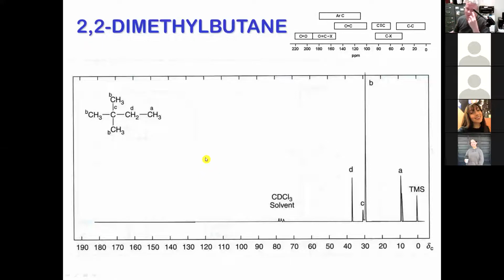Well, in proton NMR, you do see big peaks correspond to multiple things, right? So we just call that integration. Integration's numeric. This is kind of qualitative. We're like B, big peak, 3 CH3s. So integration is quantitative. This big peak thing is kind of qualitative. That's okay. And you can often figure out which signal something is by the size of the peak in carbon.